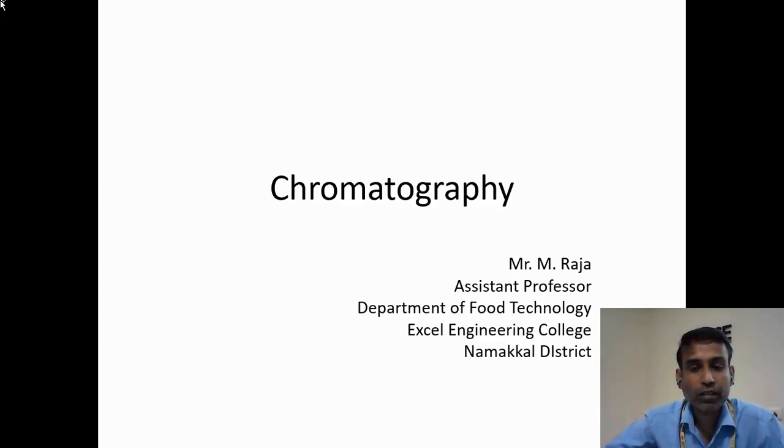Raja. I am working as an assistant professor in the Department of Food Technology. I am working in Excel Engineering College, which is located in Namakkal district. Today we are going to discuss chromatographic techniques related to food technology applications.